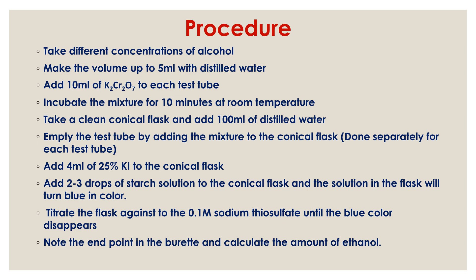After incubation, take a clean conical flask and add 100 ml of distilled water. Empty each test tube by pouring the mixture into the conical flask — one flask per test tube. Then add 4 ml of 25% potassium iodide to each conical flask. Add 2 to 3 drops of starch solution; the solution will turn blue. Titrate against 0.1 molar sodium thiosulphate until the blue color disappears. Note the end point from the burette and calculate the amount of ethanol.